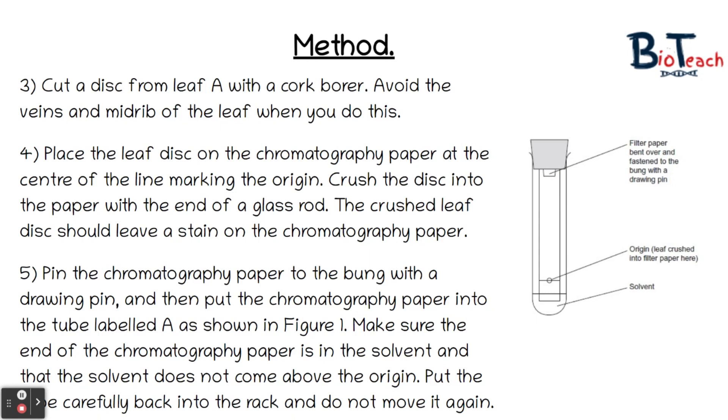Once the stain is present on the line of origin, you can pin the chromatography paper to the bung with a drawing pin and then pop the chromatography paper into the tube labelled A as shown in the diagram. You have to make sure the end of the chromatography paper is in the solvent and the solvent does not come above the origin line, as shown by that diagram as well. Then just pop the tube carefully back onto the rack and don't move it again.